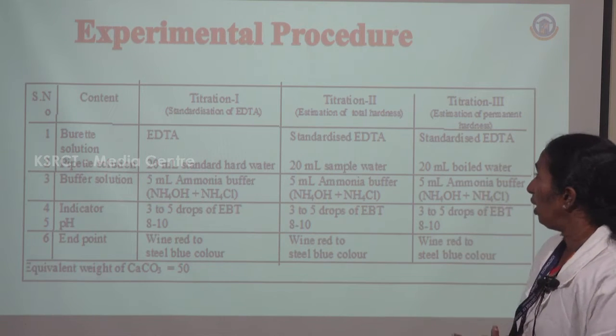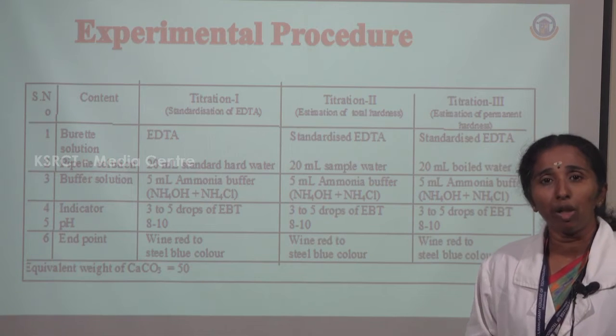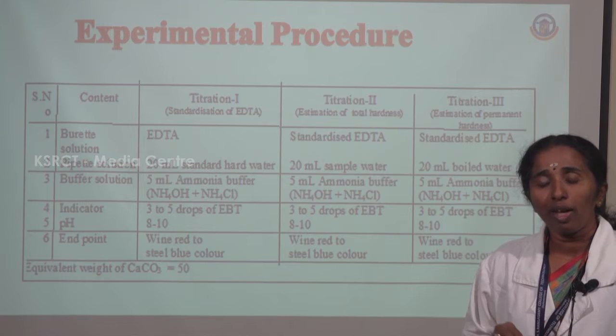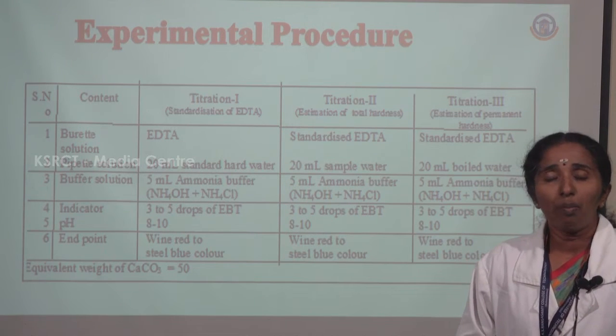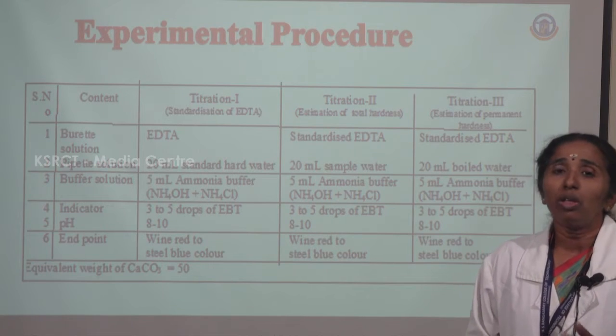For the second titration, estimation of total hardness — the same EDTA is taken in the burette, but the pipette solution is taken as the sample hard water. The same indicator and ammonia buffer are added, giving the same endpoint: wine red to steel blue.